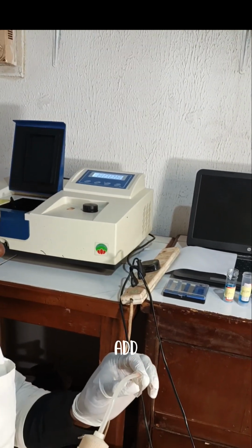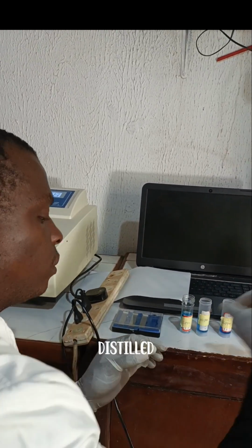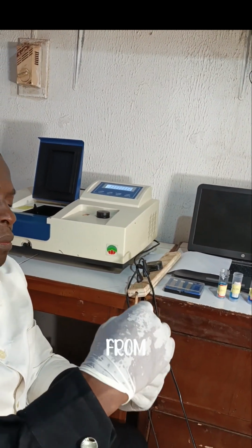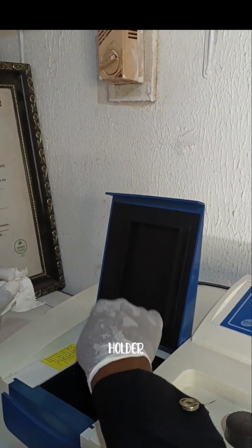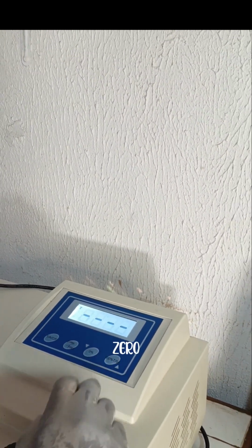Then we add distilled water, and then we clean the walls so that it will be free from water and some other things. Then we place it in the sample holder and then bring it to zero.